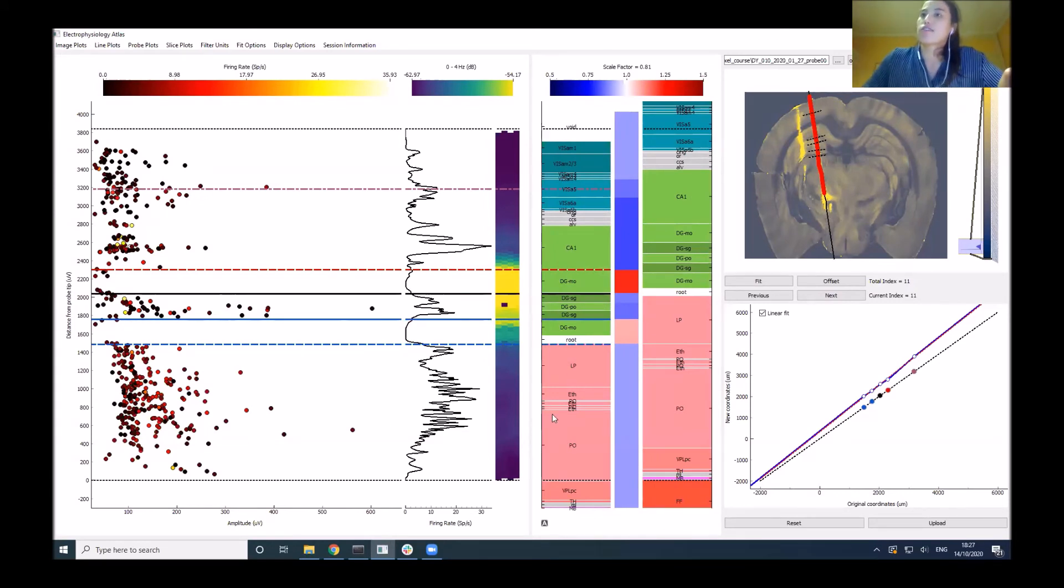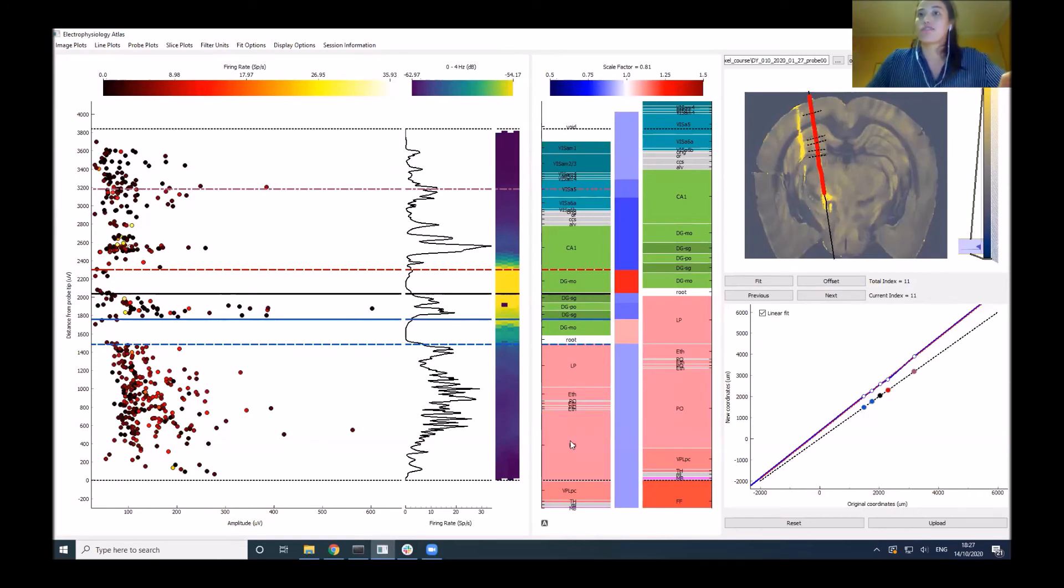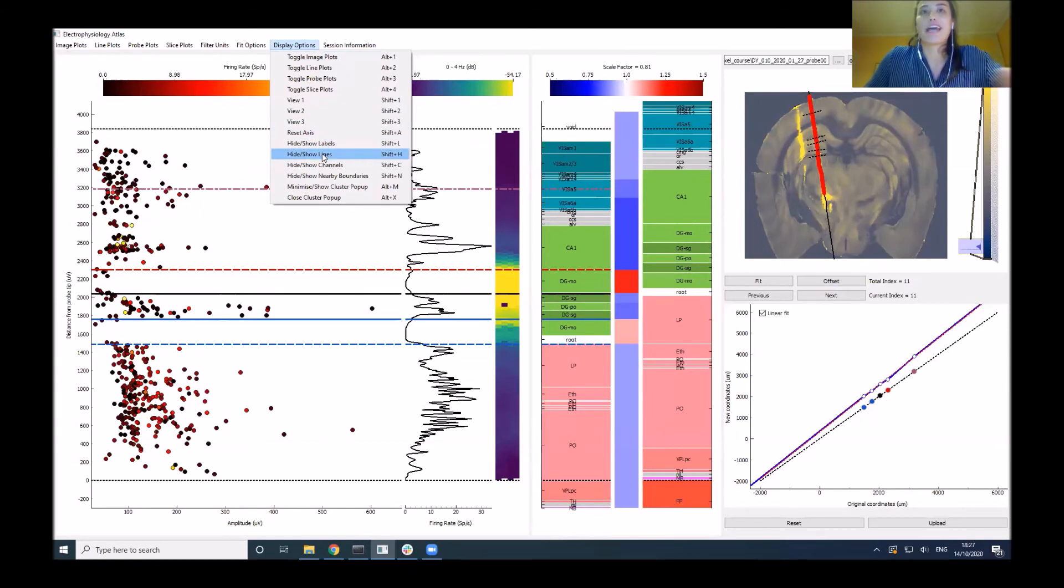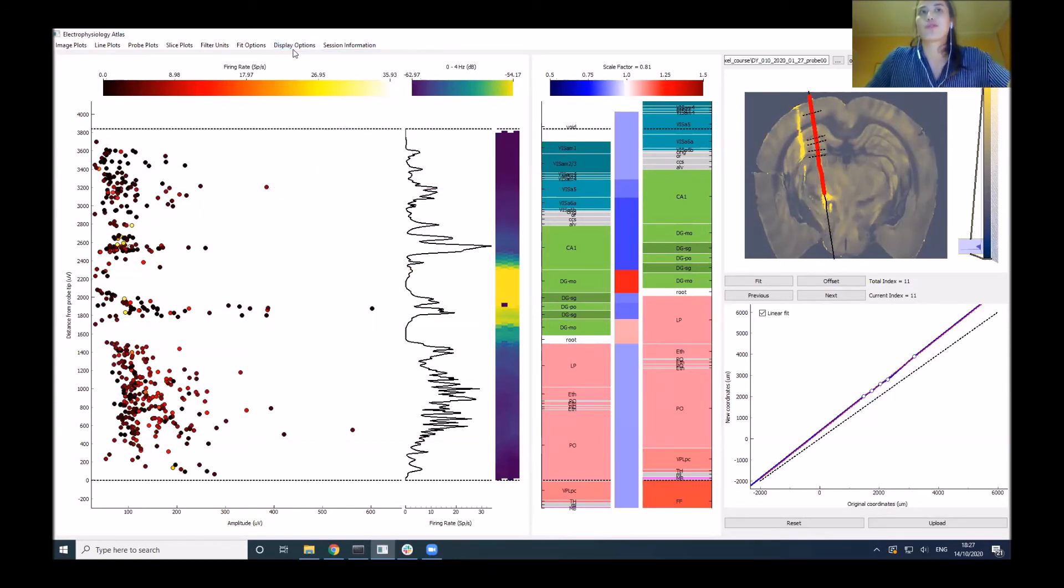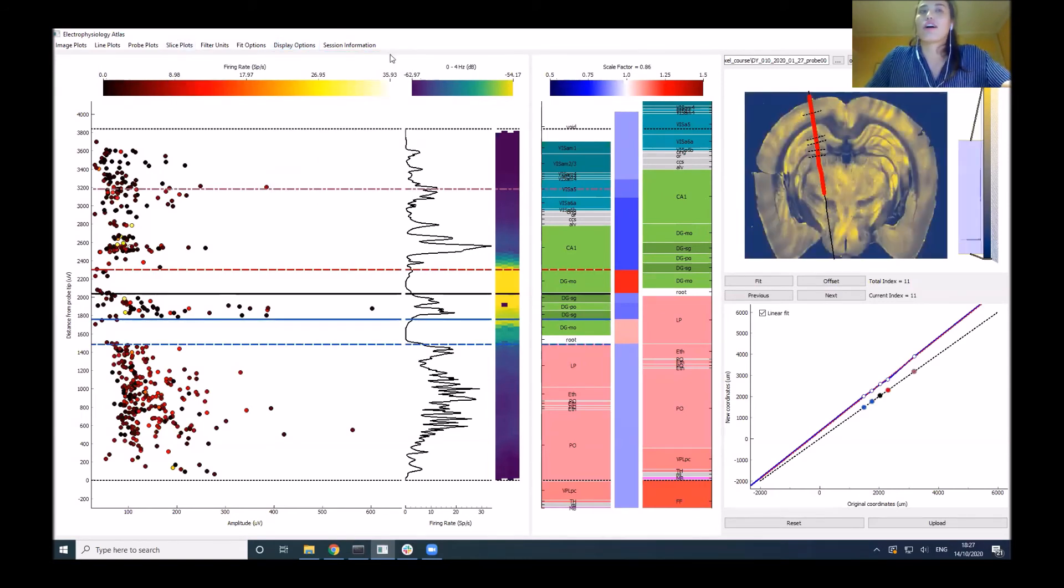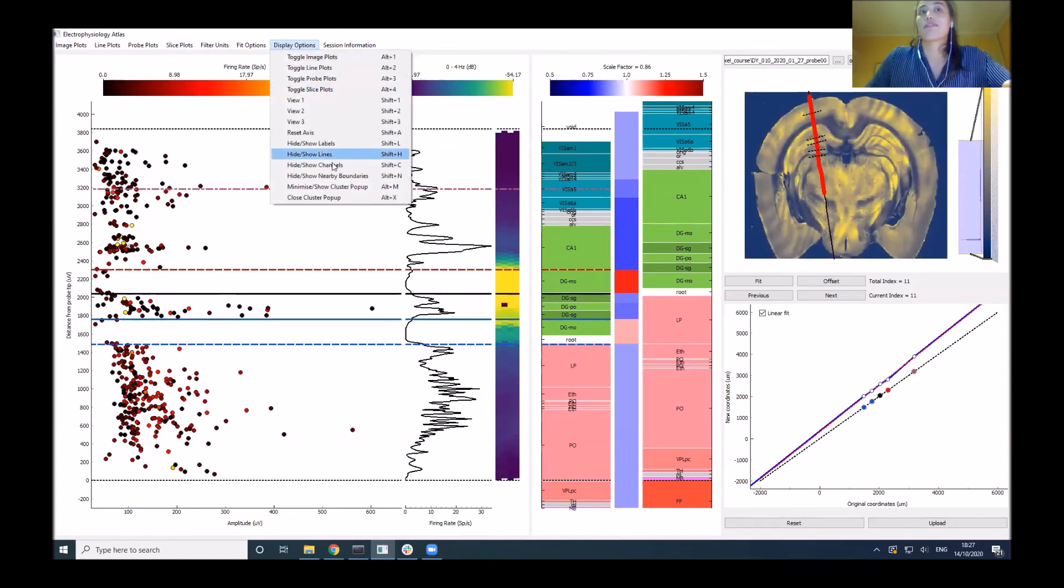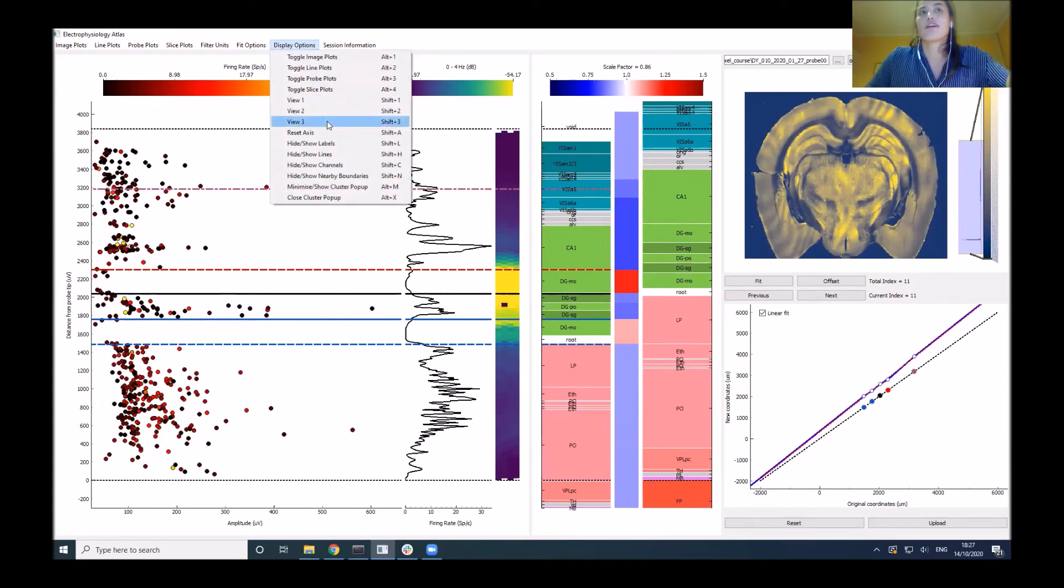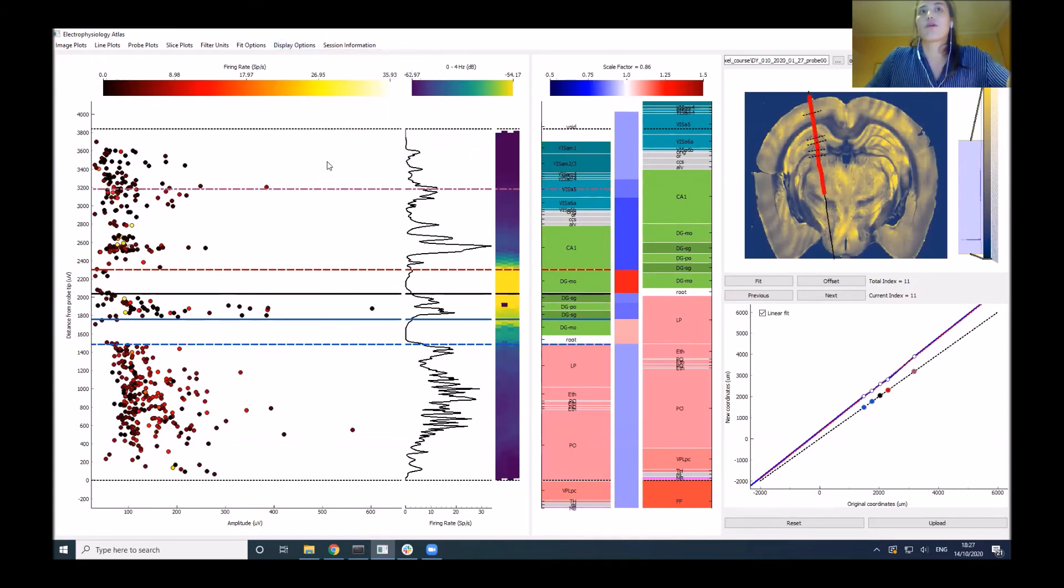I'll go through a few other useful tools you can do in this. If you want to get rid of the lines temporarily, you can toggle them on and off. If you want to just look at the histology without the channels, you can hide those. There are all these different options.